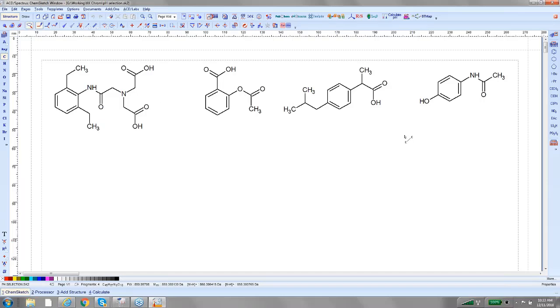it worked extremely well. Again, this is using our very much relied upon phys-chem properties that we've been doing for over 20-25 years, with very, very accurate pKa calculation and log P, so very accurate log D calculations, to get an idea of what the best pH range is to run these sort of compounds in.